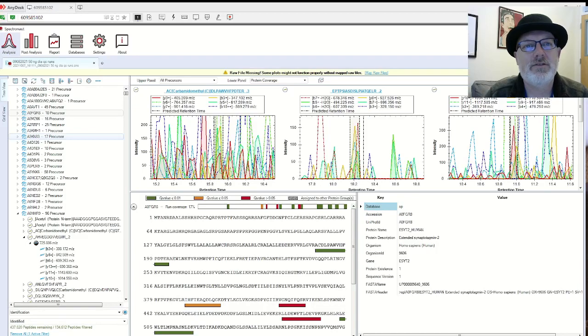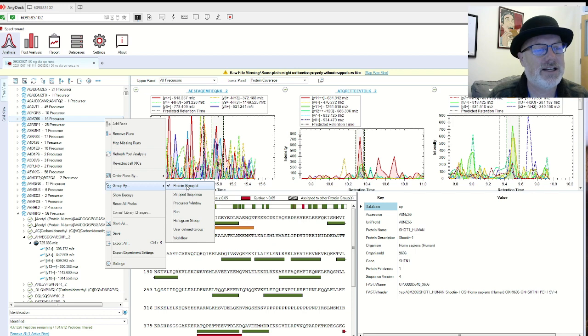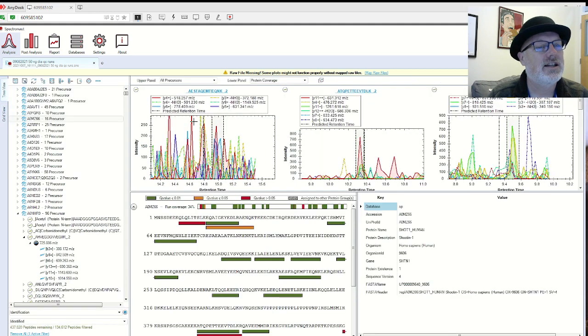All right, everybody, we're back for part 2 of our Spectronaut tutorial. Just to recap, on our first video, part 1, please refer to it if you want to, we went over looking at the tree view, the grid view, and how to reorganize the tree view based on strip sequence. We redid it with protein group ID. We looked over the grid view and looked over how to look at your data.